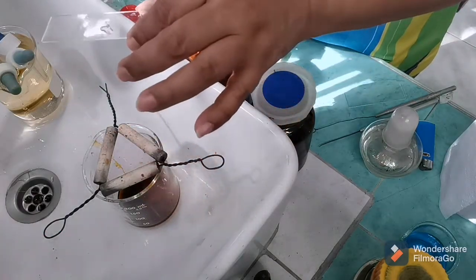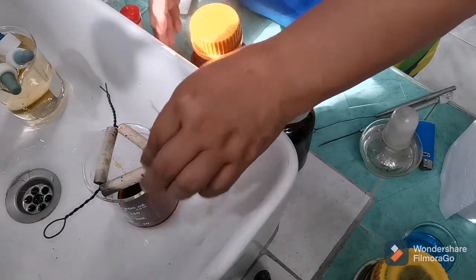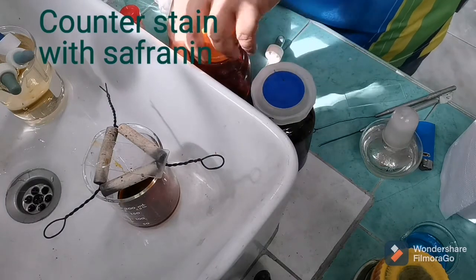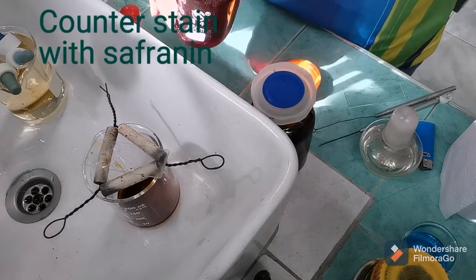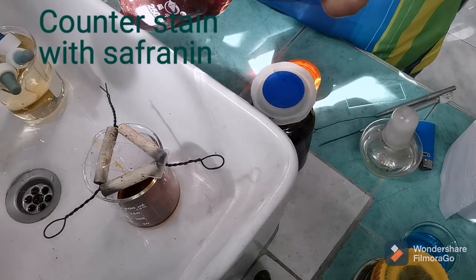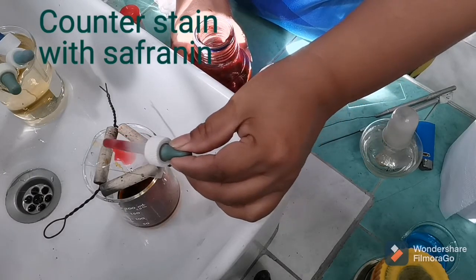So after that, we are going to counterstain this with safranin. 30 seconds only.